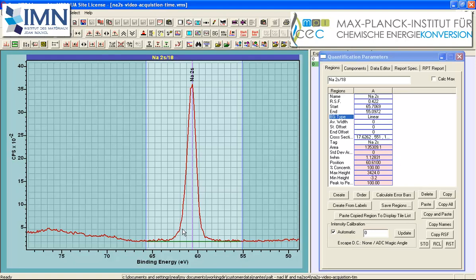And it's this calculation that we need to understand the influence of noise on how this calculation returns a value for the area. For pulse counted data, the level of noise we see in data is proportional to the square root of the counts per bin. And the way we get more counts per bin is to increase the acquisition time or increase the sensitivity of the instrument. But for a given sensitivity, we would have to change the acquisition time to achieve a better signal to noise. Hence the relationship between the uncertainty in the peak area and the length of time that we collect data.